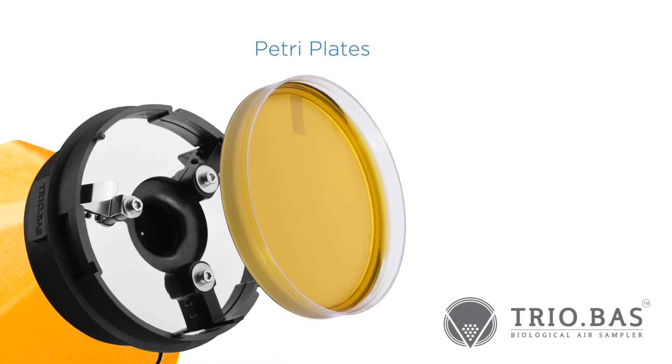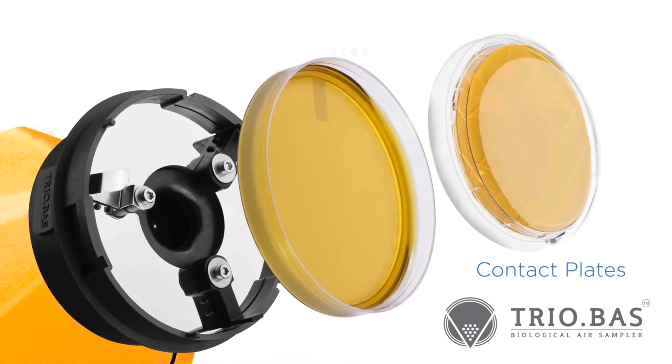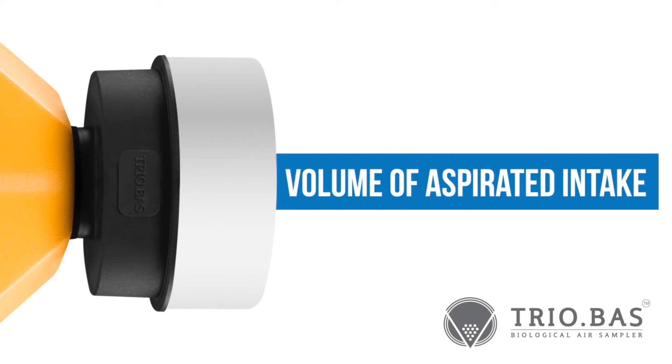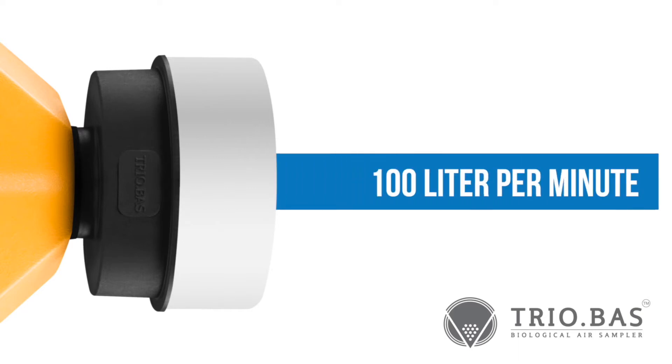Culture media options include either standard Petri plates or the smaller contact plate format. The volume of aspirated air intake is either 100 liters per minute or 200 liters per minute.